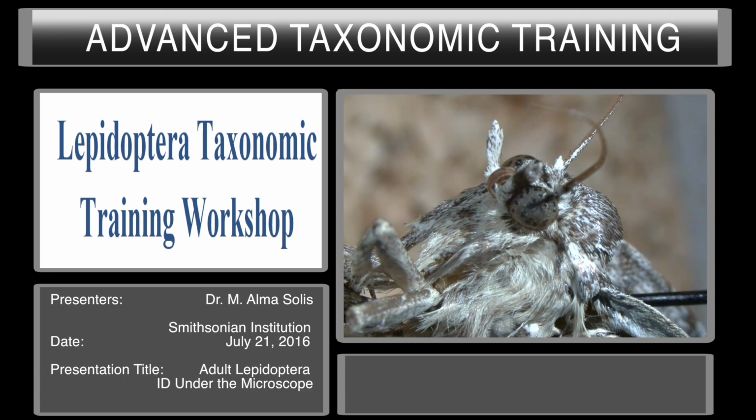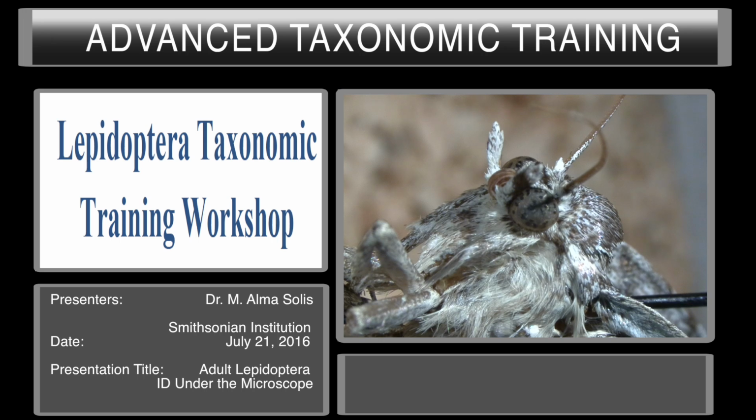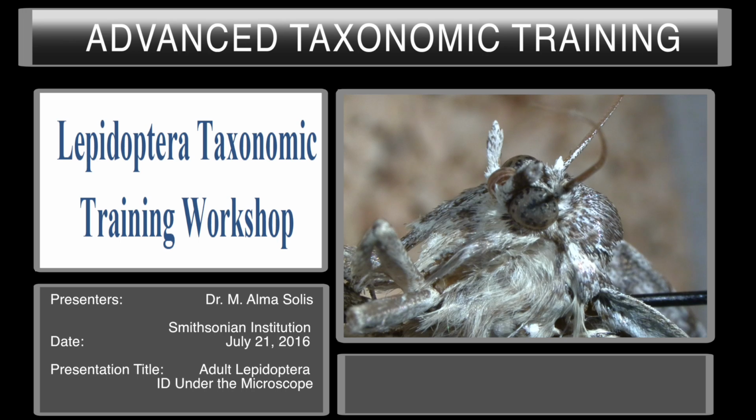Today I'm going to show you how to quickly triage moths to major superfamilies only. When I get a moth, whether it has scales or it doesn't have scales, I can quickly get it to one of 4 major superfamilies based on the scales or no scales at the base of the proboscis and based on where the tympanal organ is.